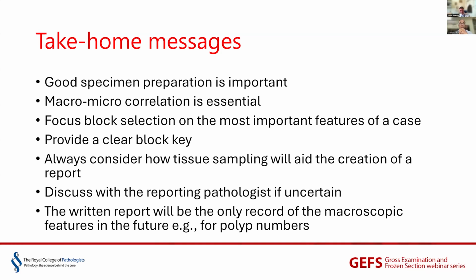Whenever you take blocks, always think about how they're going to help you to complete your data set and to answer the questions that are important for clinical management. Provide a clear block key. Whether or not that is part of your final report will depend on your individual department's policy. Often it will be put in your report, in which case it's even more important to make sure it looks clear and doesn't make the macroscopic assessment or description look too cluttered.